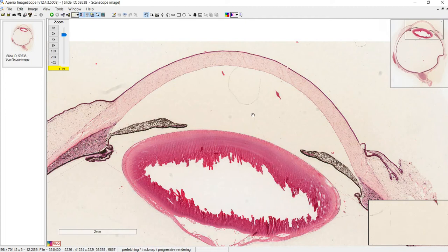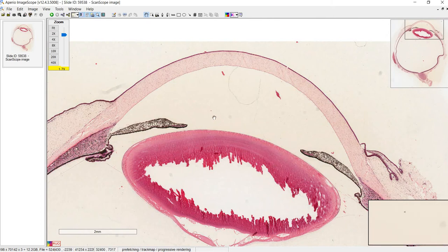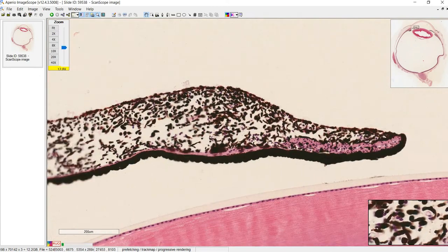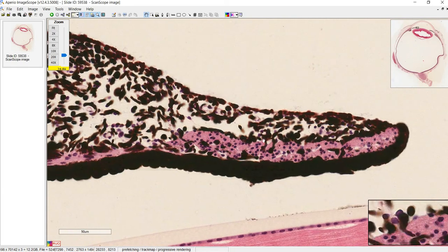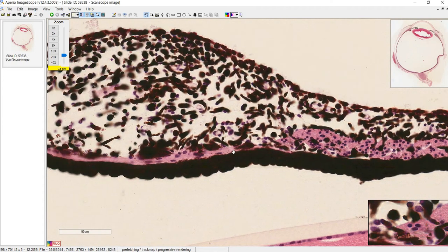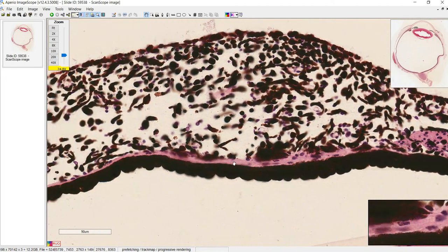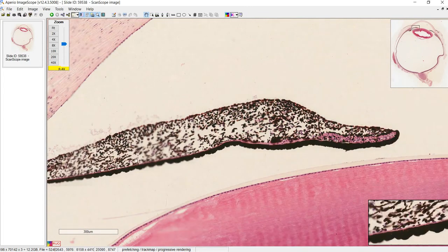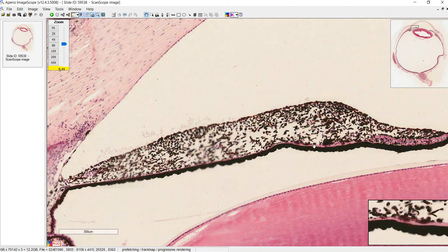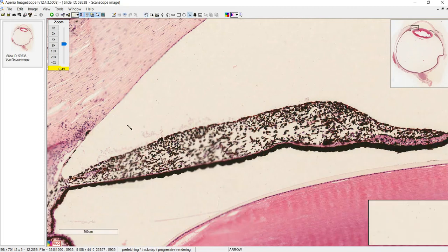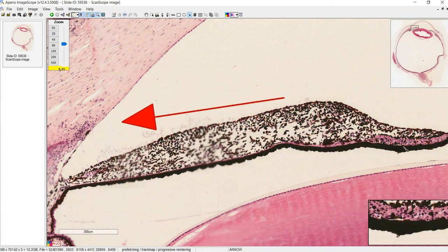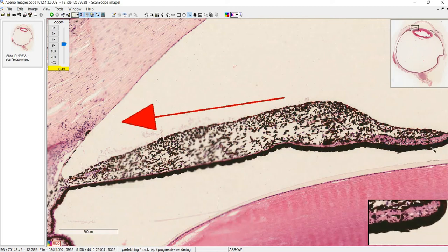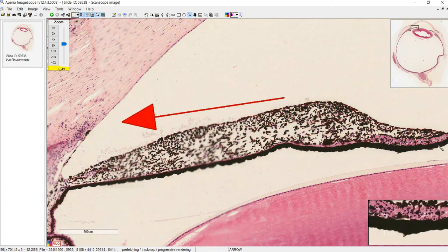Going back to the monkey's eye, let's talk about the iris and the pupil. The pupil is the space between the iris — it's what enlarges or constricts based on how much light is coming in. There are two important sets of muscles: if you look here, you can see transverse sections of the pupillary constrictor muscle, and moving closer to the ciliary body, these are longitudinal sections of the pupillary dilator muscle. The constrictor is a sphincter, so when it contracts it pulls the iris inward, constricting the pupil.